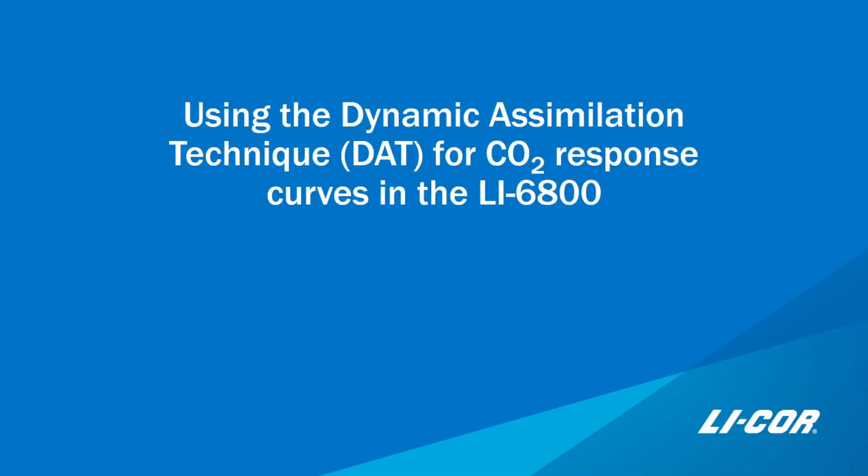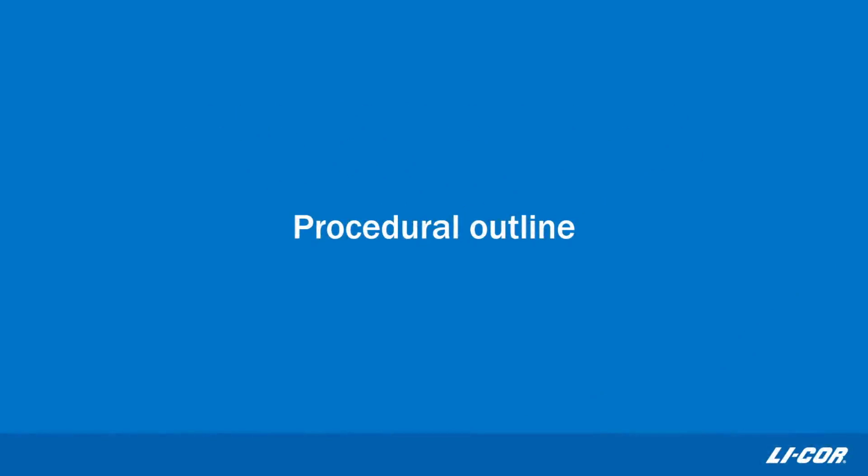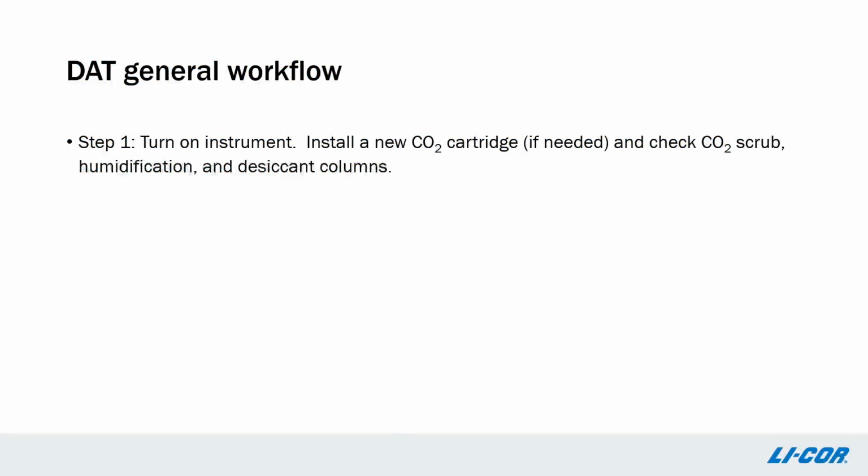This video will demonstrate how to use the Dynamic Assimilation Technique for CO2 response curves in the LI-6800. Here's the general workflow you should use.